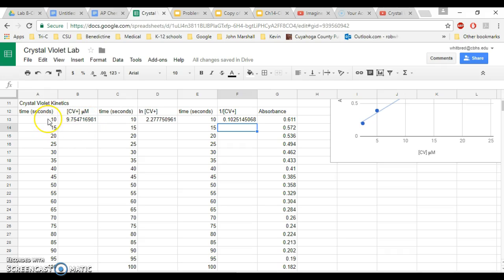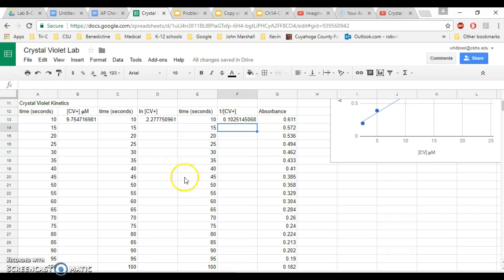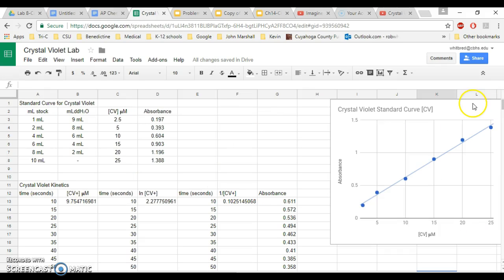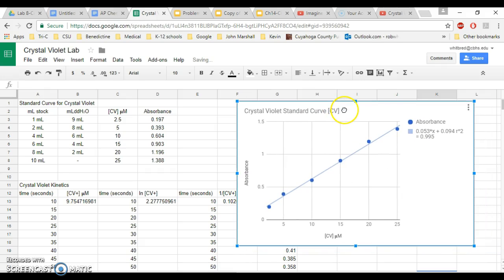And what you're going to do here is, after you've set this up just like I did with the times here and the absorbance over here, in order to have it calculate for you so that you don't have to sit there and calculate every single concentration, which would be really annoying, instead you can set up a formula, and the formula that you're setting up has to do with the equation that you did before. So if you look back at your crystal violet standard curve, you have an equation over here, and this equation can be manipulated.